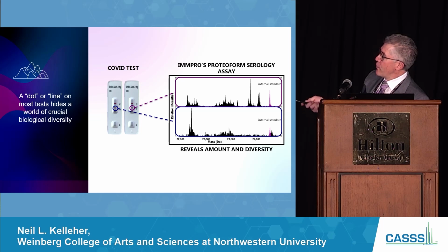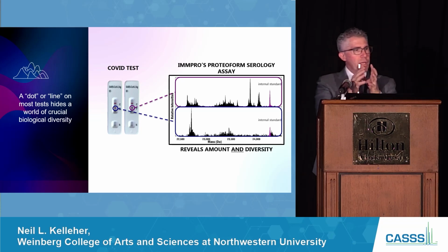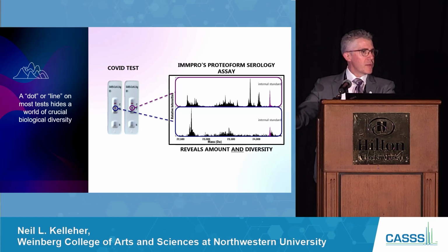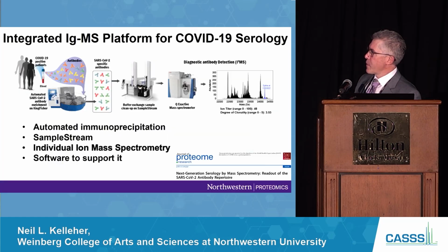And you can resolve single clones and assess different people. This is person 1, person 2. So you can get not just a titer, but how many different clones somebody has generated to fight off an antigen. And I'm going to slow this down, tell you how I got the data, and then show you some more patient data as we go.